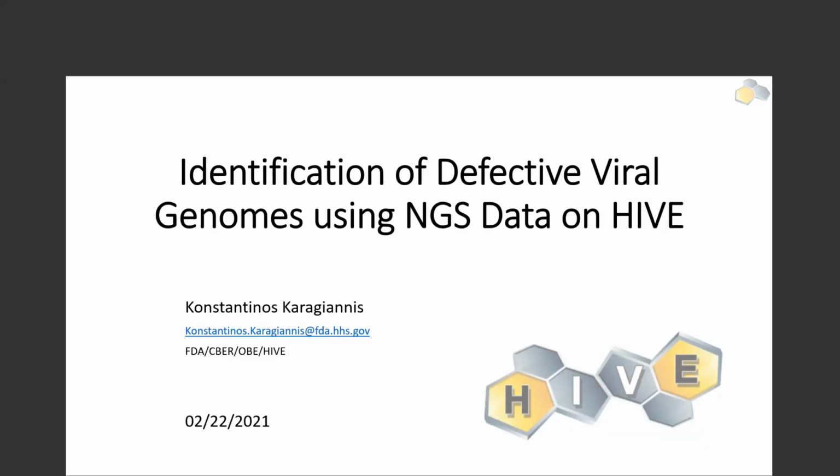my slides right now. So first of all, thank you, Raja, for inviting me, and thank you for organizing this series of seminars. This seminar is going to be focusing on the defective viral genomes using NGS data on HIVE platform.